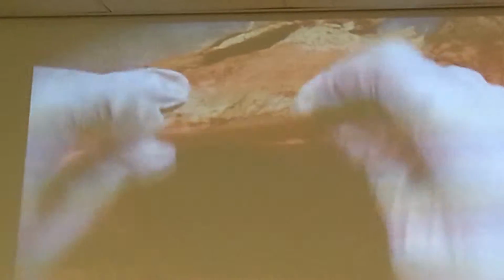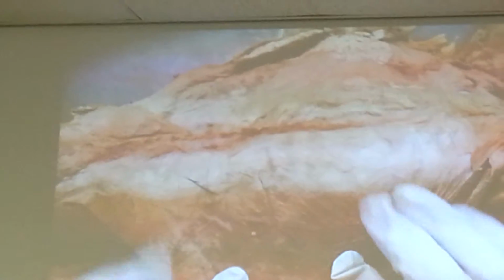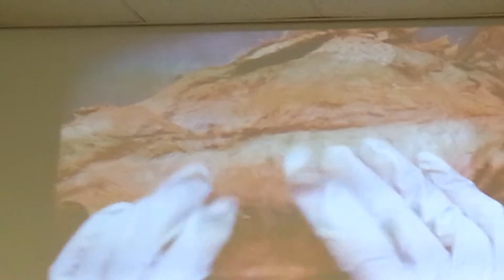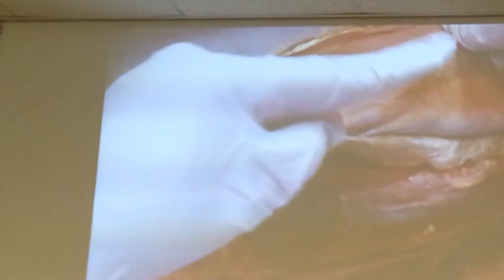Now, beneath this aponeurosis, when you open it, you will see another muscle. Miss, can you open it up again so we can see? See? This is external oblique muscle, right? No, the aponeurosis. Yeah. I show you. This is the external oblique. When you put it away, this is the aponeurosis of the external oblique. You see up to here, you see the muscles, and it continues with its aponeurosis. This one is an aponeurosis.